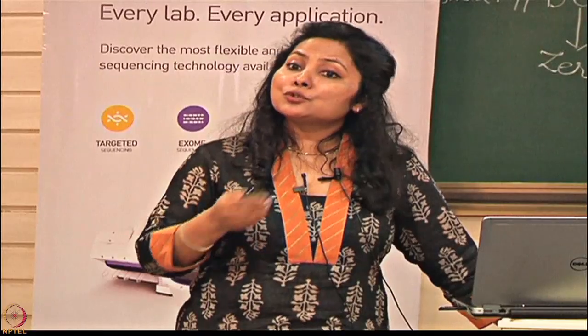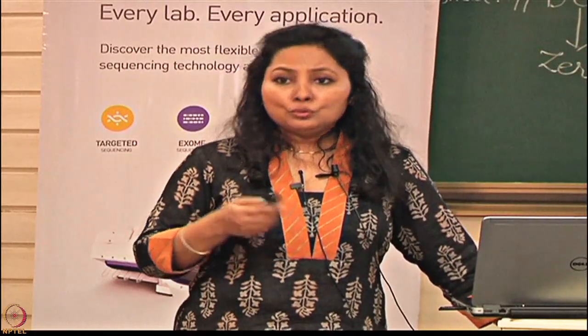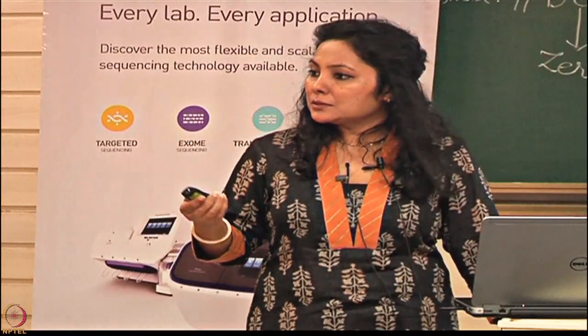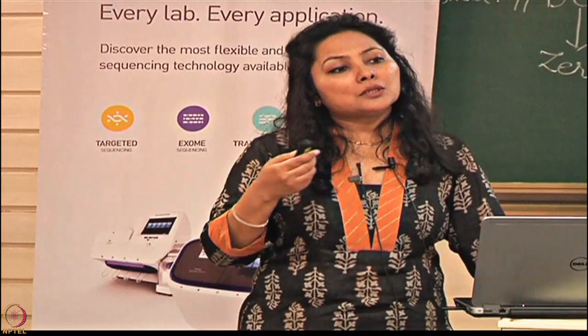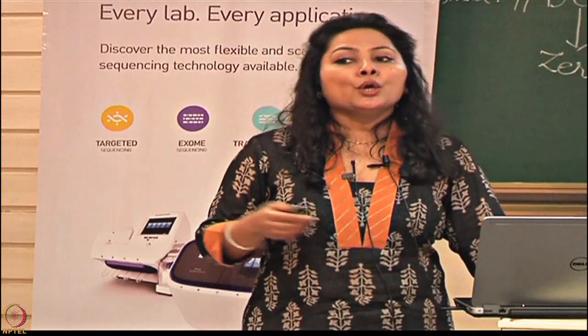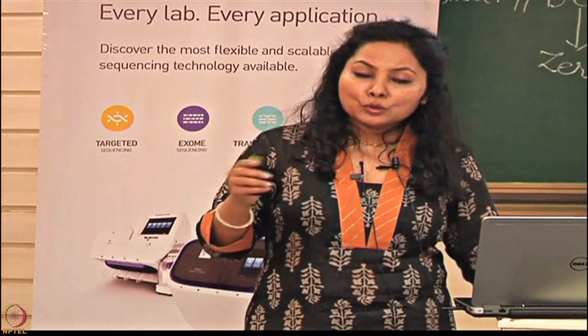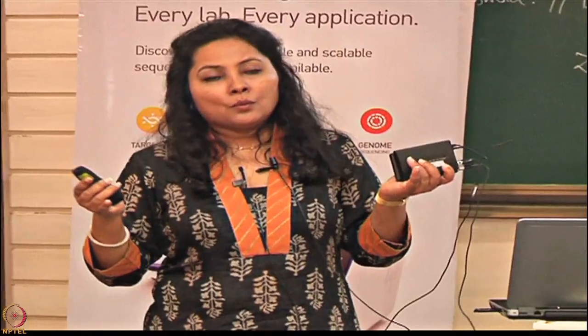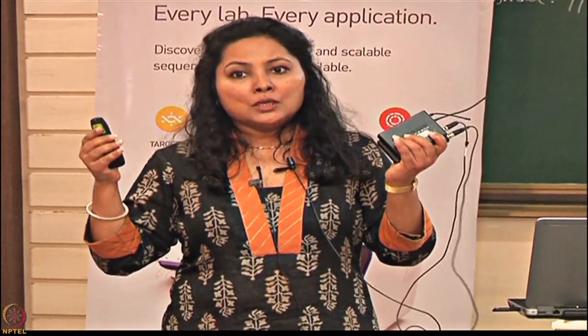Once you've broken down this genome, these are the fragments which you finally want to sequence, but you don't know what is there, so you need to have some adapters or linkers, which will help facilitate sequencing these regions. So in library preparation, what you're doing is you are enriching the region of interest, and second, you are ligating it at both the ends with linkers. These linkers are double-stranded DNA fragments, which are exploited so that the primer can then sit on these fragments.